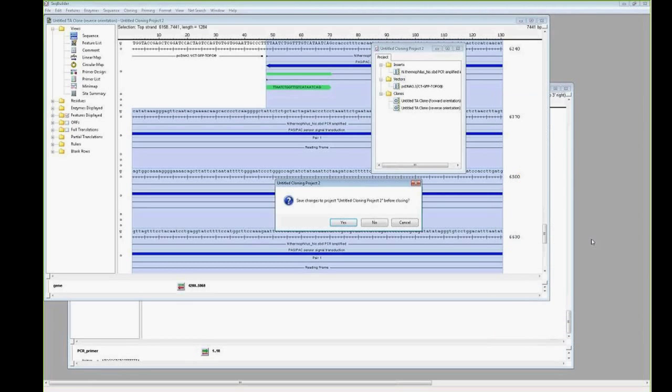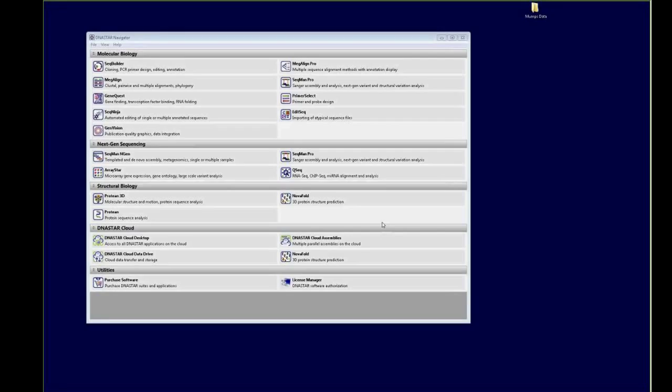Katie, before you do that, thank you. We've had quite a few questions come in. I'm just going to get to a few of them, and others will come back to possibly after the webinar directly with some folks. The first one, right in the cloning, the question is, can I use my own vectors for cloning projects? Yes, absolutely.